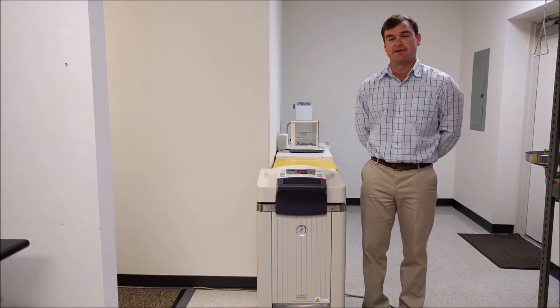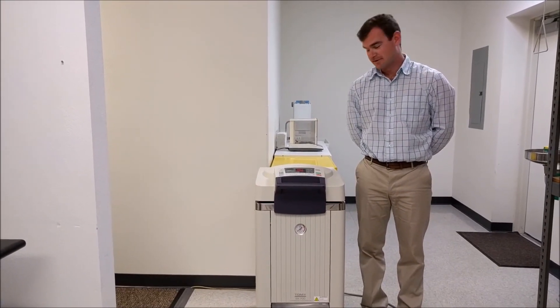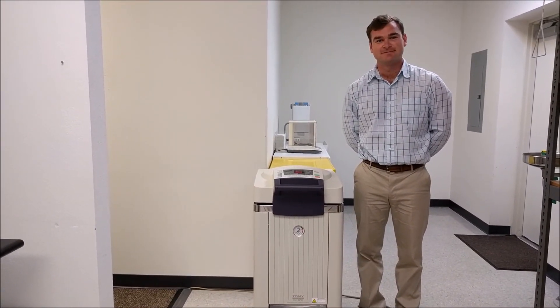We also carry an SX500, which is the 50-liter version of this exact same model.